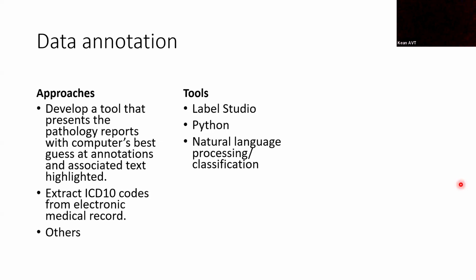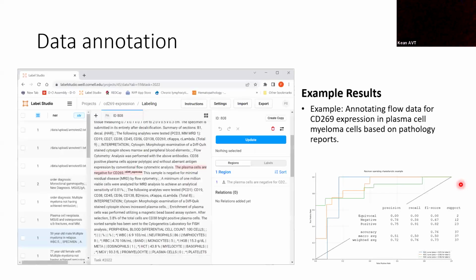And of course, other approaches. So I like to try and be creative about doing the least amount of work to annotate the data as possible. Some tools we have available though are Label Studio. We can use natural language processing.